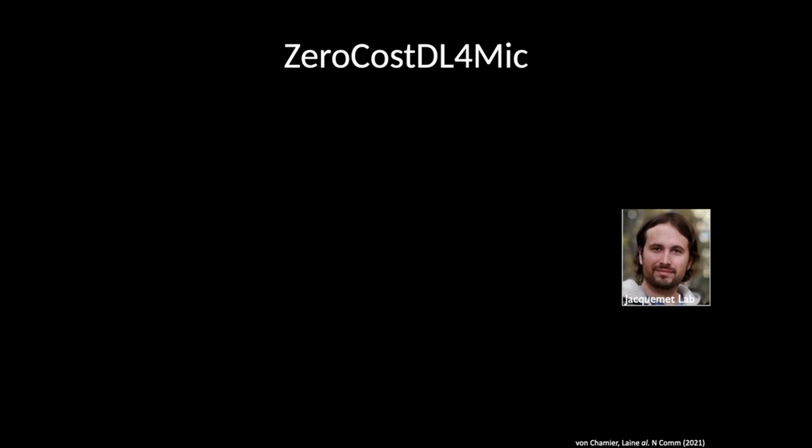So we wanted to make these easier for everyone to use. Because on one side, you have this idea that you need training data or you need pre-trained models that are able to encapsulate the experiments that you want to do. And I showed you some solutions for that, right? There's the model zoos where you can now start picking up models and do transfer learning with them. And then there's the other perspective, which is you need access to high-powered GPUs to run these machine learning tasks, and you need to learn how to do it.